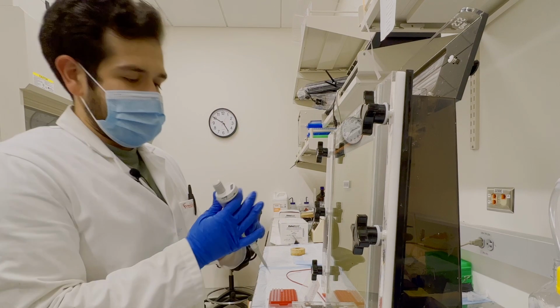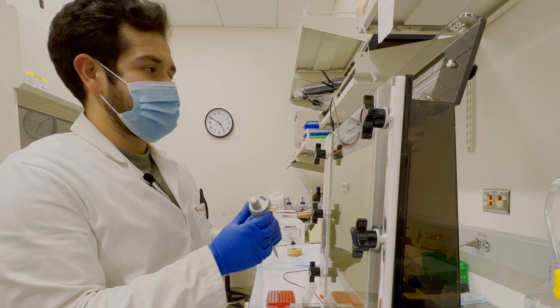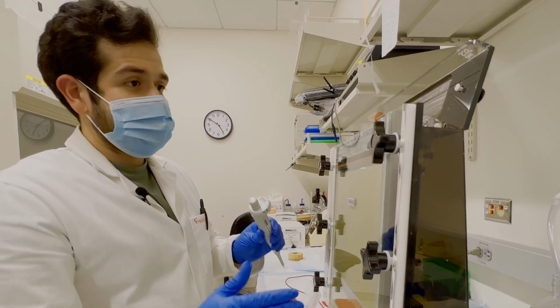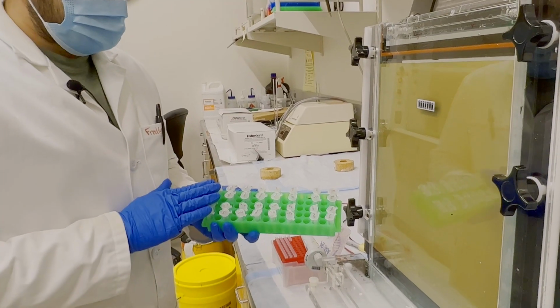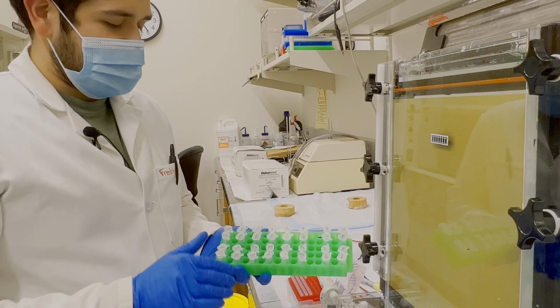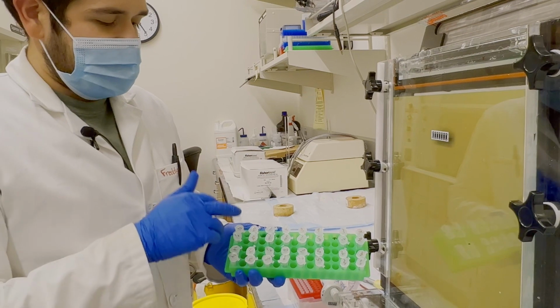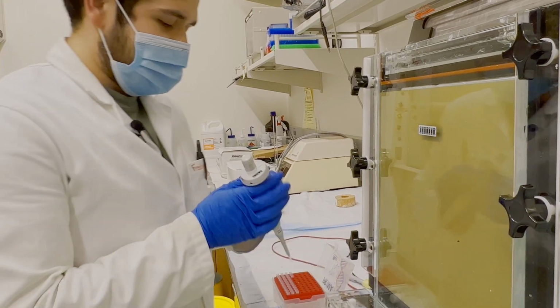What we're going to do is use 6 microliters for every well. These wells can hold up to 8 to 10 microliters, but 6 microliters in each well for each sample should be more than enough for this assay. So now, before I add the samples onto the gel, let me talk a little bit about how I ordered these samples. As you can see, I ordered the samples in columns, and in these columns you have the respective time points in order, and which time points belong with which group by the superscript as compared to the subscript.